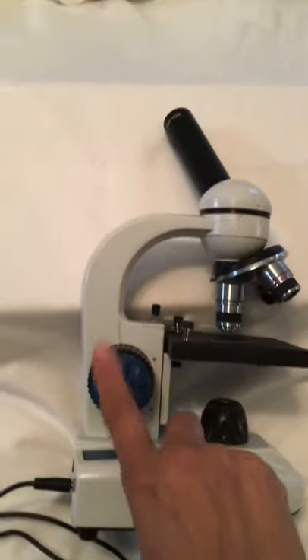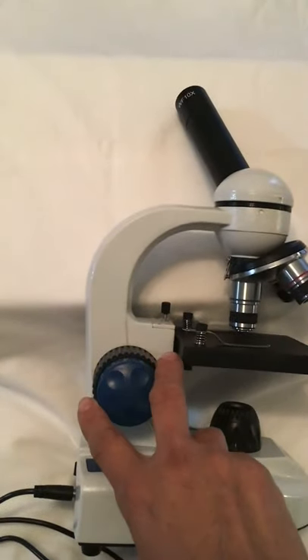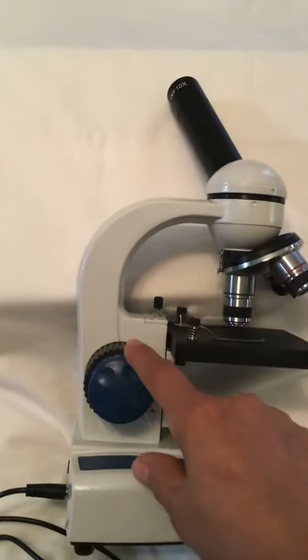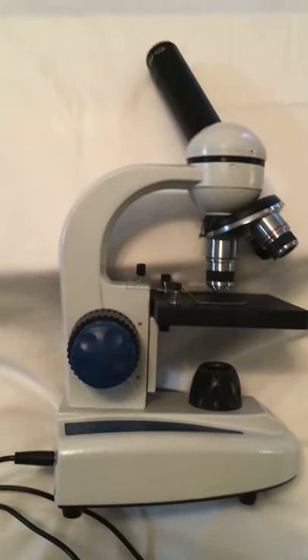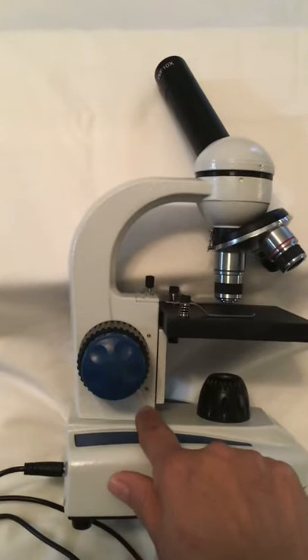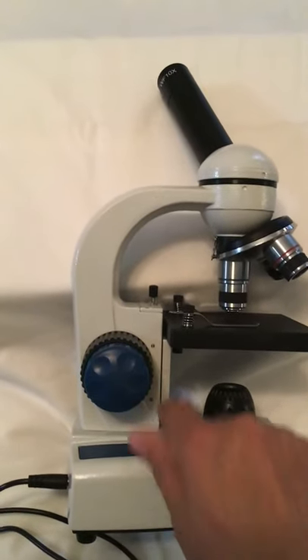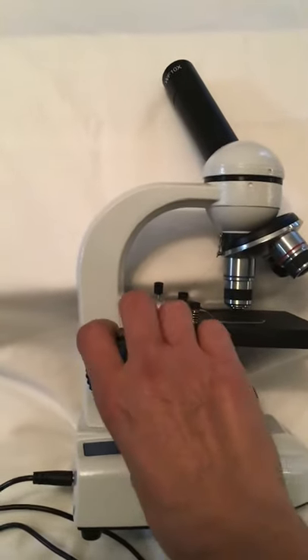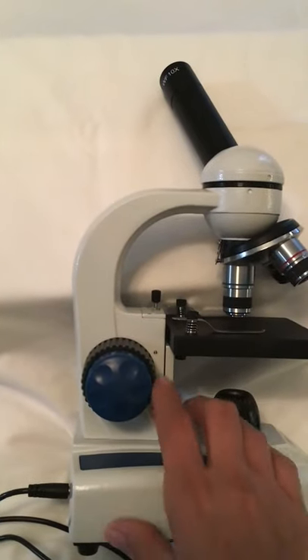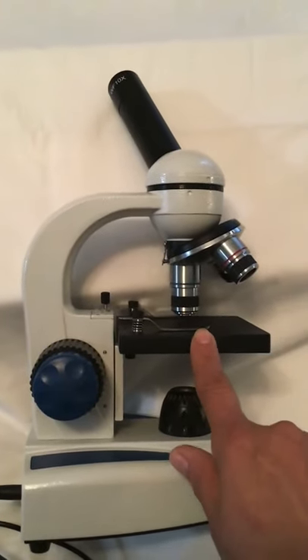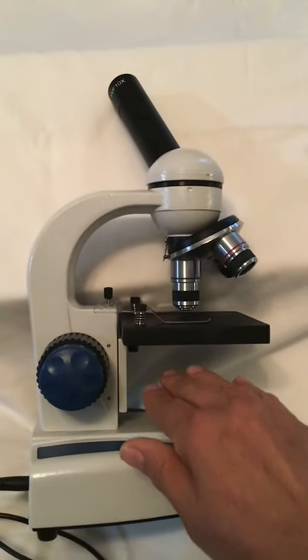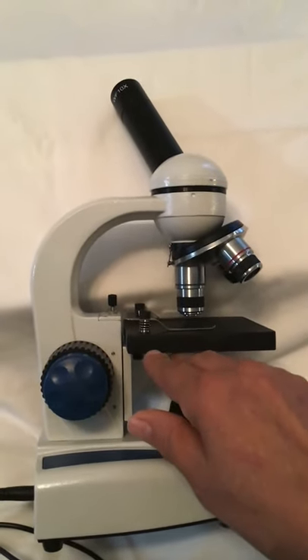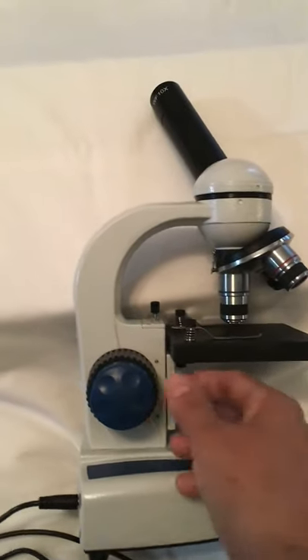From the arm, it goes to these two knobs. These are the coarse adjustment and the fine adjustment. In the microscopes that we have in the classroom, the fine adjustment is a smaller knob that's usually placed either down low here or up on the top. The coarse adjustment is the knob that moves the stage up and down, so it brings the slide up to the lenses or pulls the slide away from the lenses.